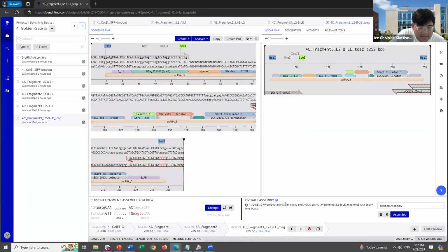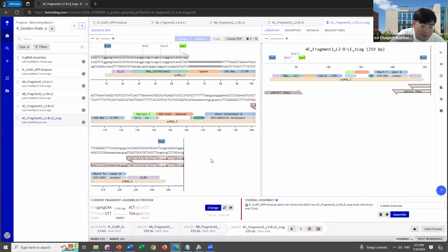So whenever you do this design, you can also check, in the in silico step, whether this cloning will work or go smoothly as you planned. And this is very useful because sometimes you're building up the inserts you want to put in, and it's going to be harder and harder every time when you're trying to make something bigger. Sometimes it's not going to give you an absolute no. It's just going to give you some suggestion like, hey, it seems like your sticky ends are so similar that you may have some non-specific ligation, or some products that you may not desire, something like that. So that was a pretty useful situation as well.